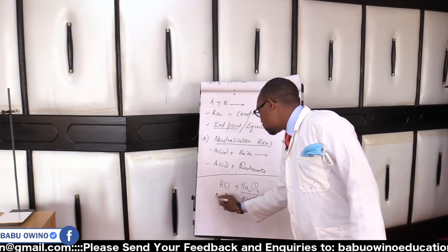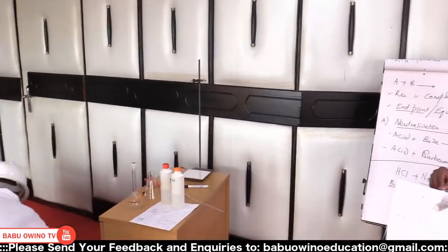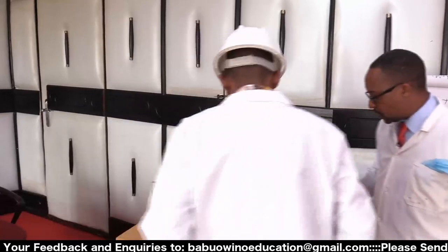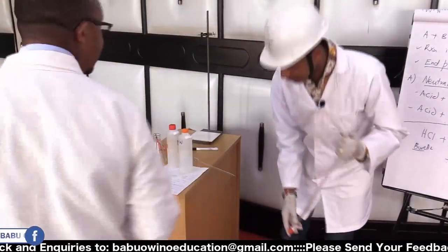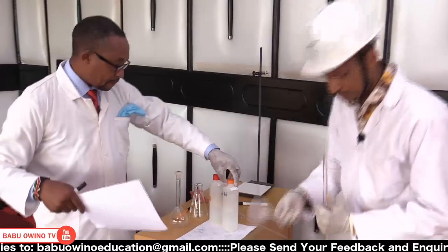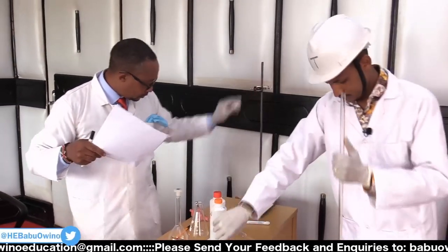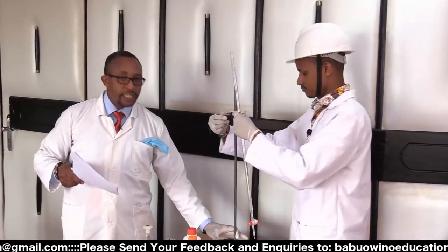So we want to see now Mheshimiwa doing the experiment. He will put the acid. And the acid in this case is HCl. First, he clamps the burette. Let us see how it should be done.